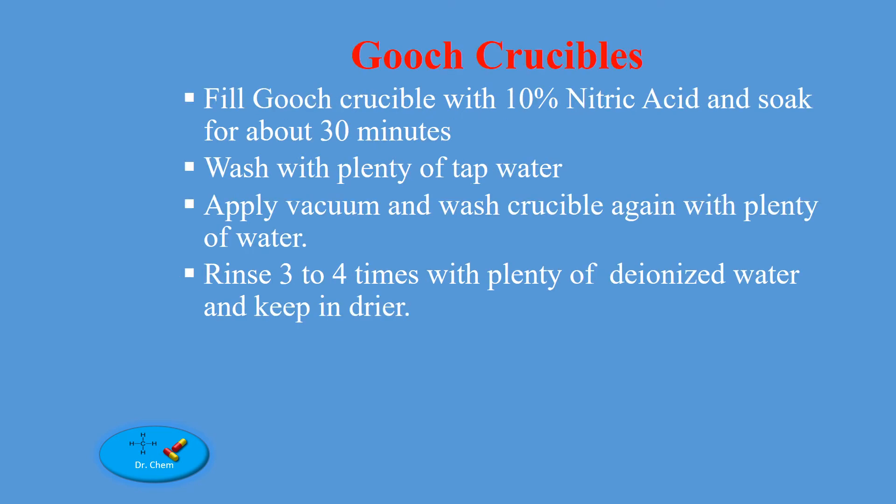For Gooch crucibles: fill the crucible with 10% nitric acid and soak for about 30 minutes. Wash with plenty of tap water. Apply vacuum and wash the crucible again with plenty of tap water. Rinse three to four times with plenty of deionized water and keep it dry.